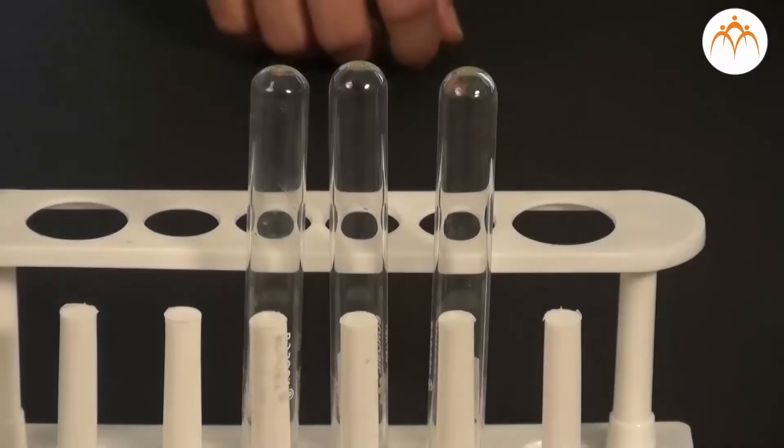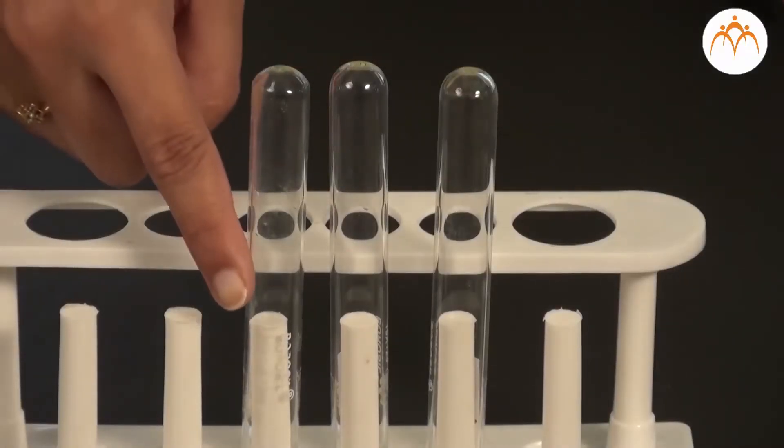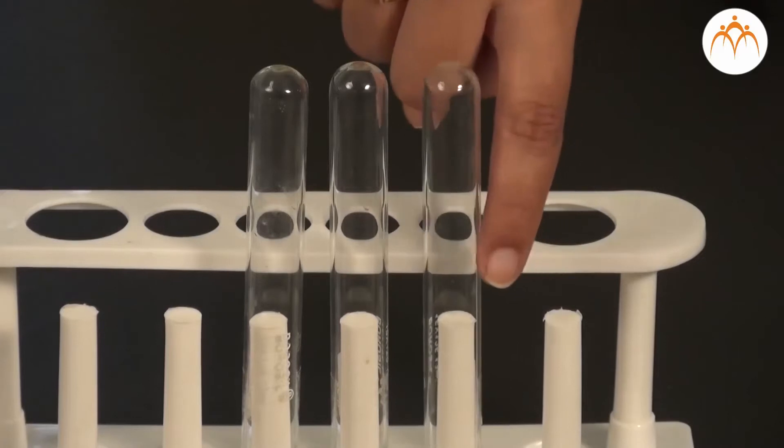In this experiment, we will identify chloride, bromide and iodide ions from the given salts. We need apparatus like test tubes, stand, droppers, etc.